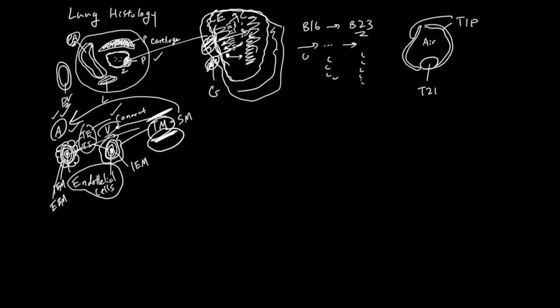And here you have the type 2 pneumocytes. Let me go one step back. Here you have a lot of columnar cells, right? So here are the columnar cells with cilia. But as you go down the lung branches, the cells will become cuboidal. And as you go down even more, the cells are now squamous. And eventually these squamous cells will surround the airspace, which is the alveoli airspace. And here you have the type 1 pneumocytes that I introduced in this cartoon.